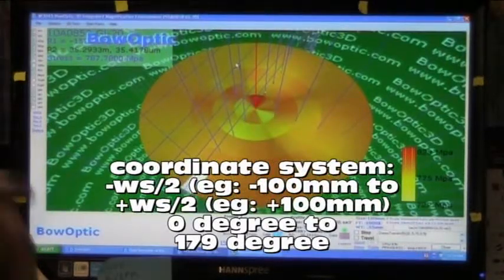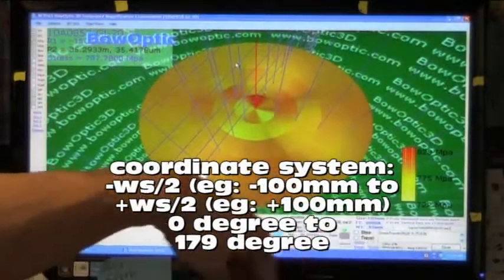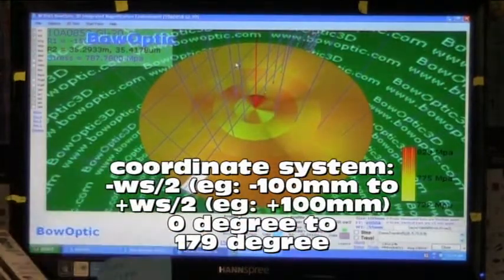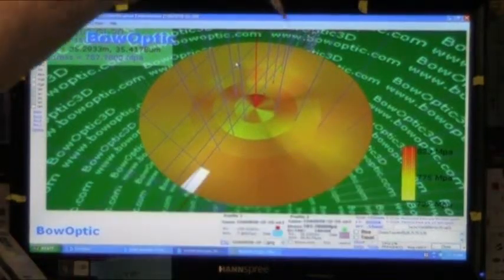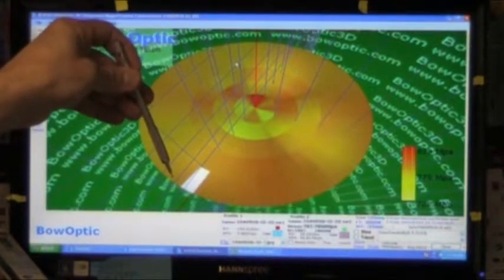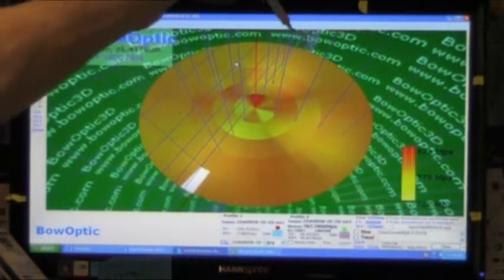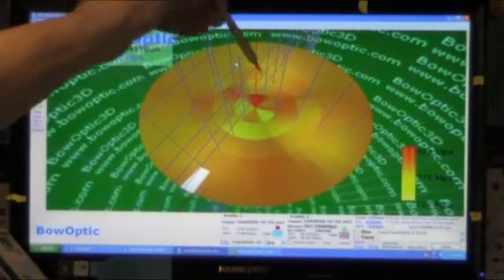For a 200 millimeter wafer, the coordinate system is minus 100 millimeters to plus 100 millimeters. Zero degrees is the angle that the wafer is loaded into the tool.